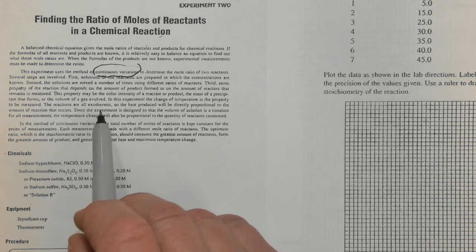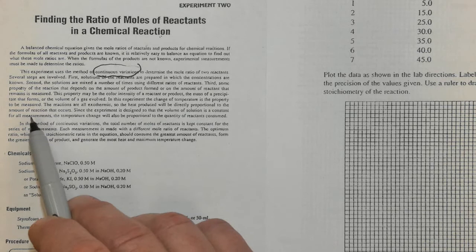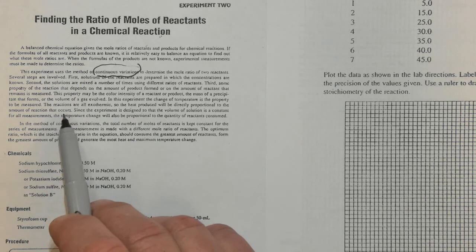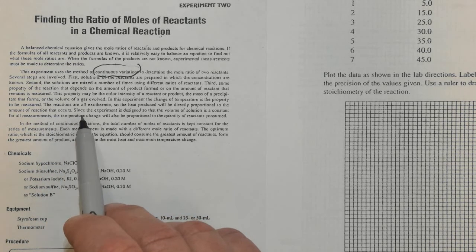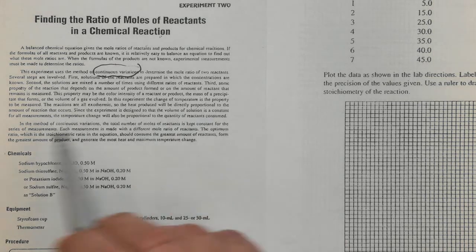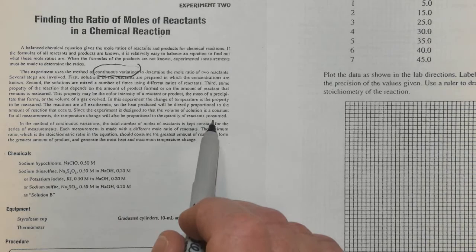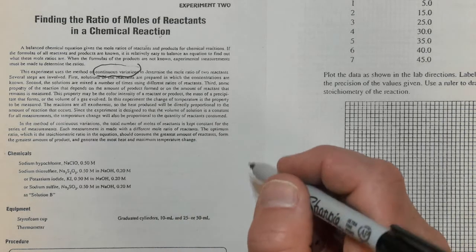The reactions are all exothermic, so the heat produced will be directly proportional to this amount of reaction that occurs. Since the experiment is designed so that the volume of the solution is constant for all measurements, the temperature change will also be in proportion to the quantity of the reactants consumed.